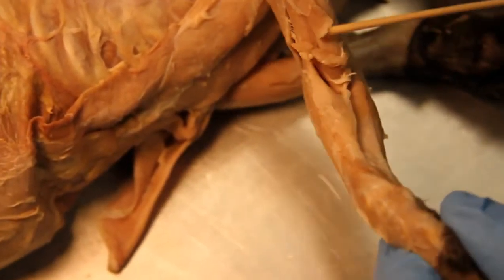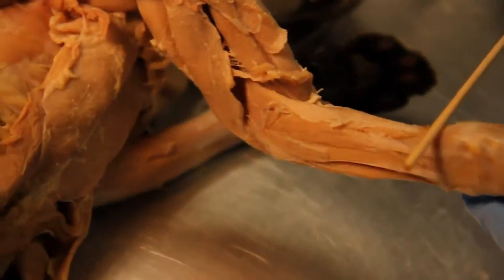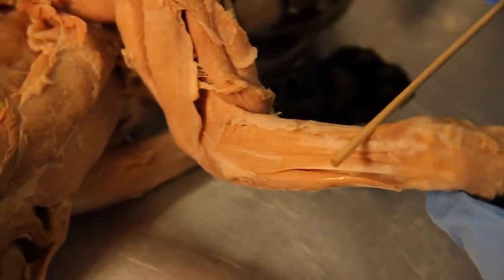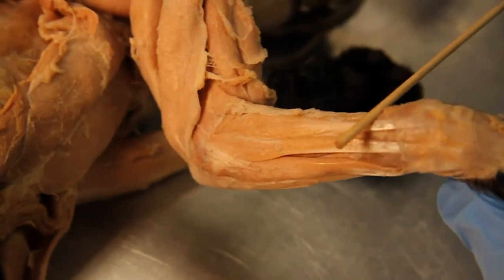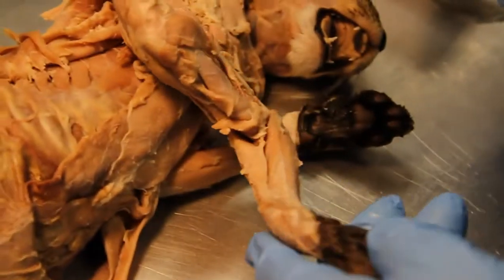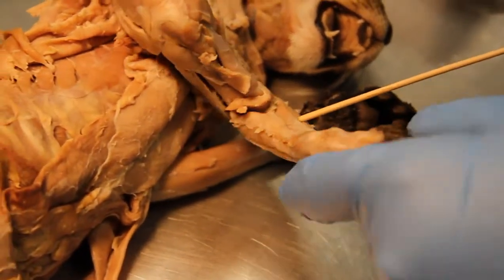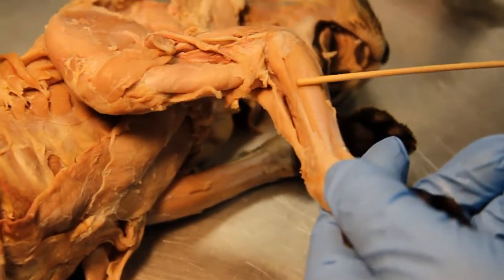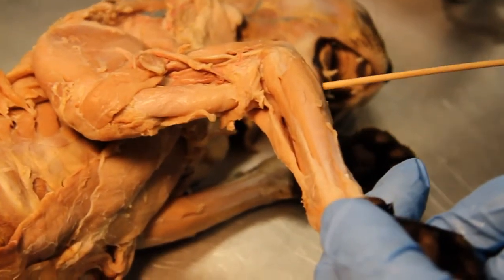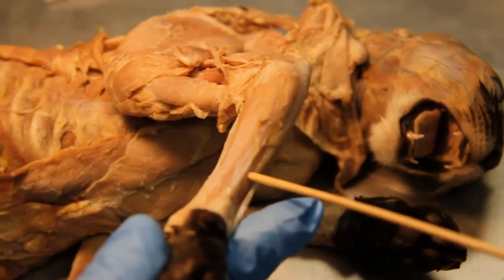I'll show that from more beside. The extensor carpi radialis — right there. So then we have the flexor carpi radialis, the palmaris longus, and the flexor carpi ulnaris.